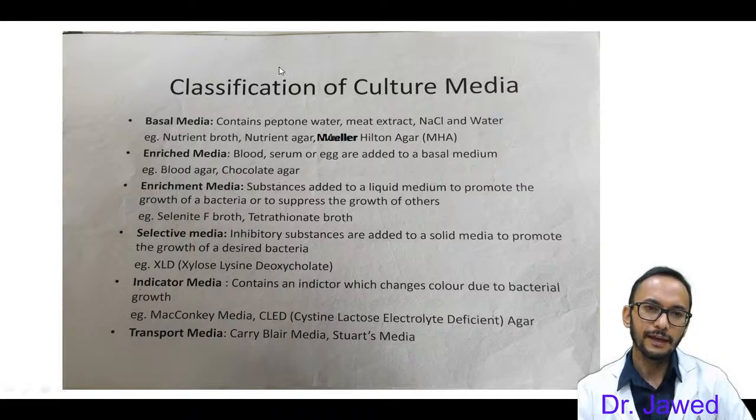And next is enriched media. Basically, we'll add something nutritious to the basal media to make it enriched.